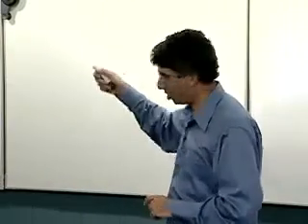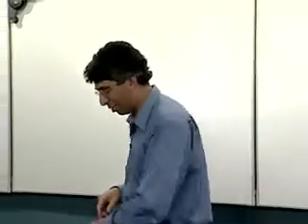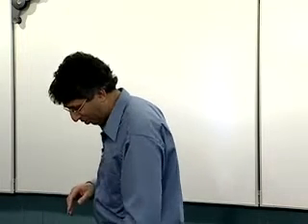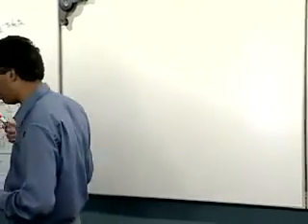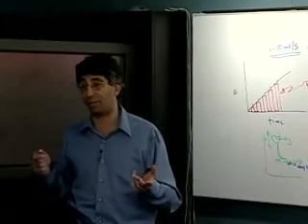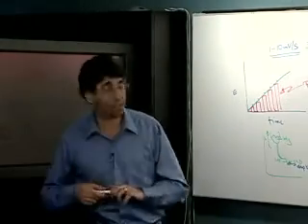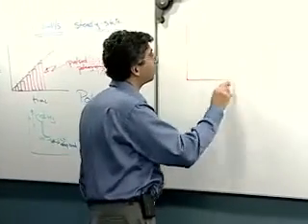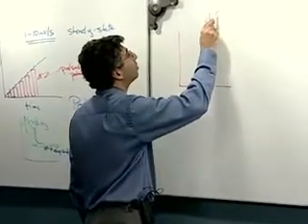Now, another derivation on this, which is useful, after pulse polarography, is differential pulse polarography, which is getting more AC again. Differential pulse polarography might be done on a mercury electrode, but need not be done on a mercury electrode. It might be done on a solid electrode also. So the idea is going to be, in this case, differential pulse.